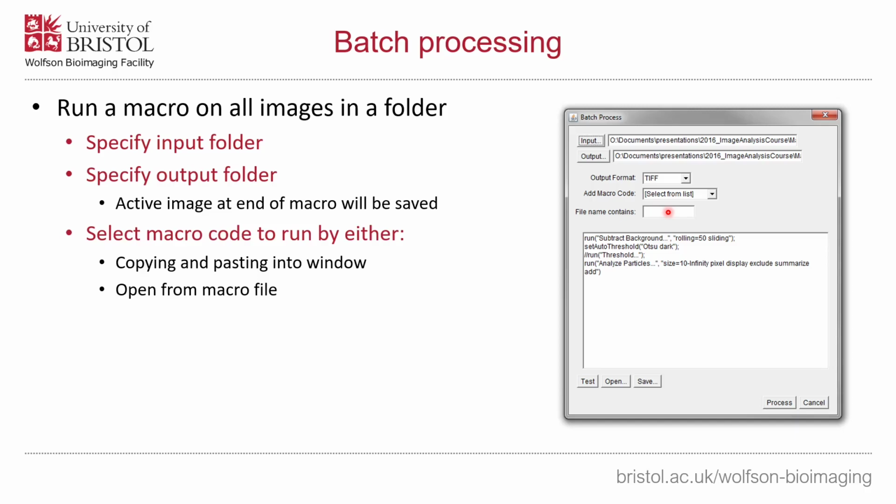And also, you've just got to be aware of maybe not using GUI elements. If you've got any of these dialog boxes that pop up, that could cause problems, because if you've got 1,000 images, you don't want it to keep popping up and asking, do I want to filter with median and a radius of 2. If you do have those options, you're better off hard coding them at the beginning, just explicitly defining the variables.